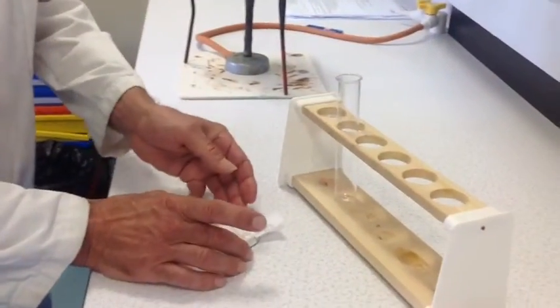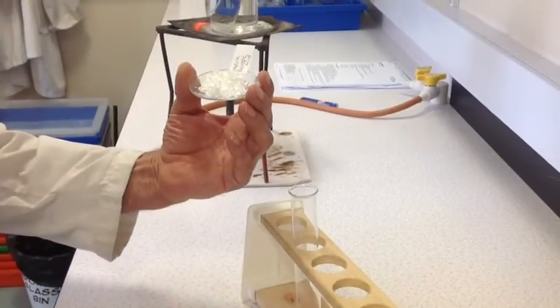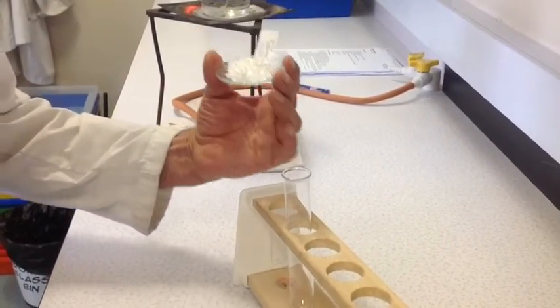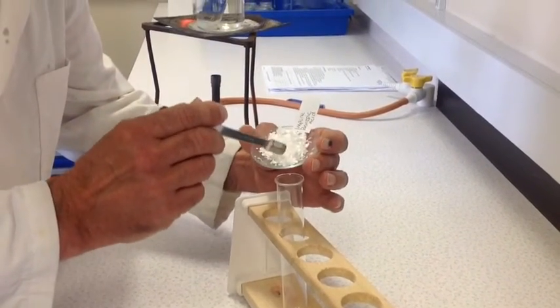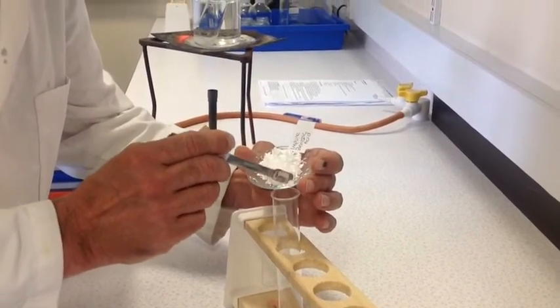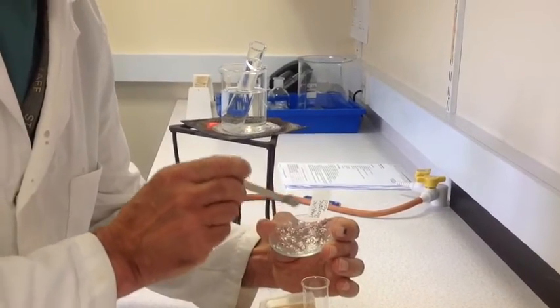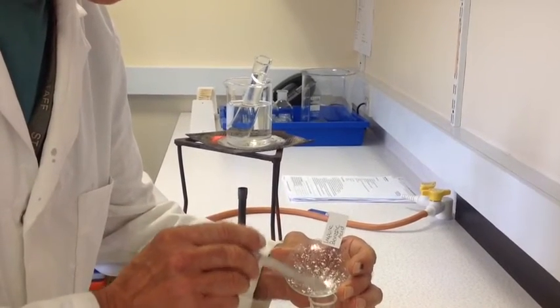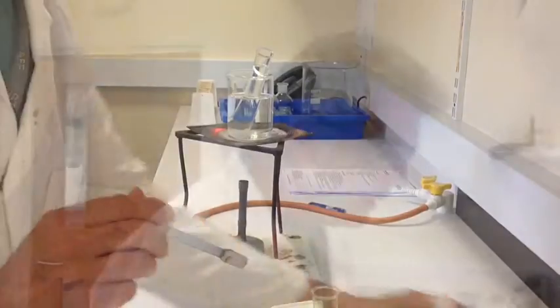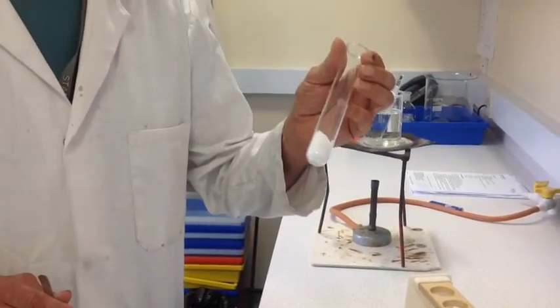First of all I'm going to get a boiling tube and the Benzoic Acid Crystals from last week. I'm going to add all of these into the boiling tube. So very carefully — it might take a couple of minutes. I've now added all of the impure Benzoic Acid Crystals into the boiling tube.